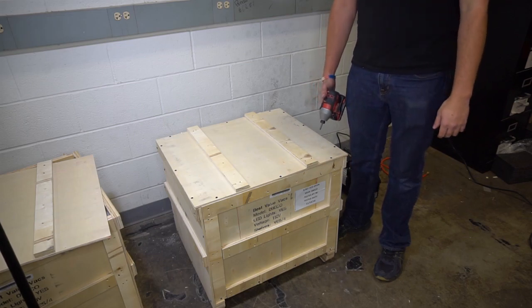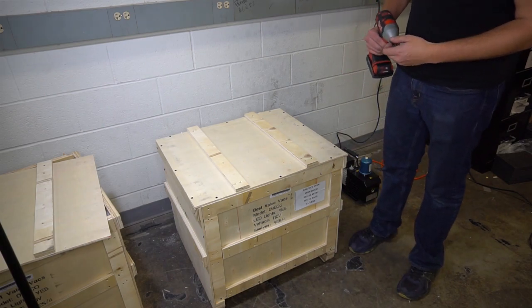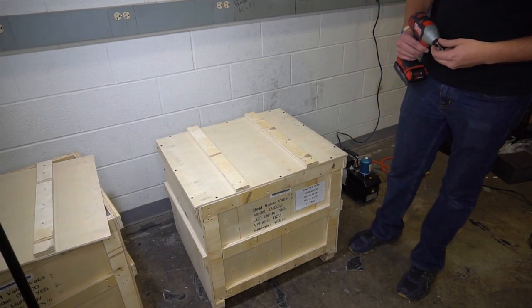Hey everyone, we're here today in the Best Value Vacs Oven Quality Control Center. We're going to go over a quick unboxing of a .9 cubic foot Eco Oven.